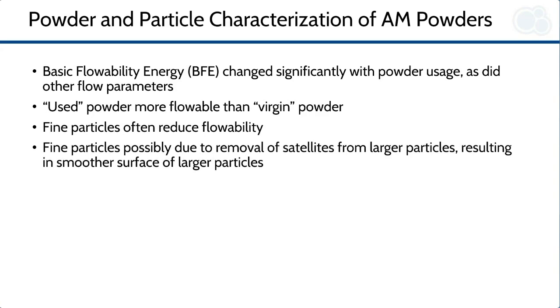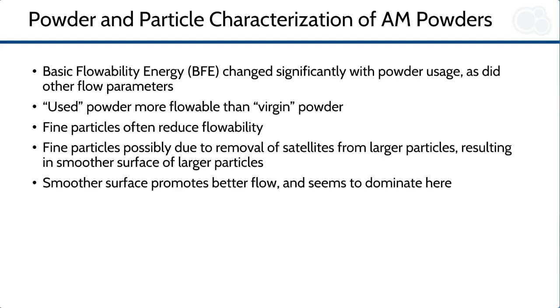Recall, though, we proposed that the increase in fine particles was the result of removal of satellites initially attached to larger particles, resulting in smoother particle surfaces. Smoother particles certainly promote better flow, and that seems dominant over the addition of the fine particles in terms of feedstock flow determined here.